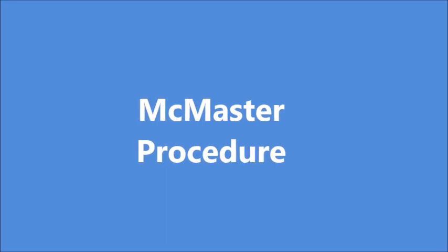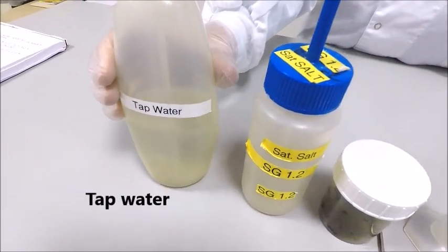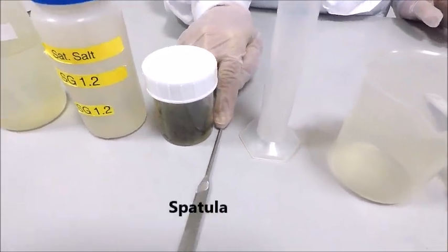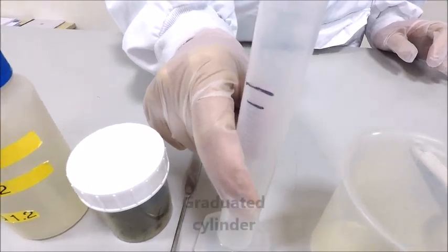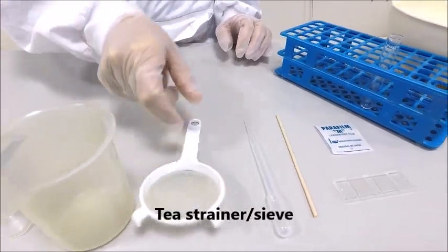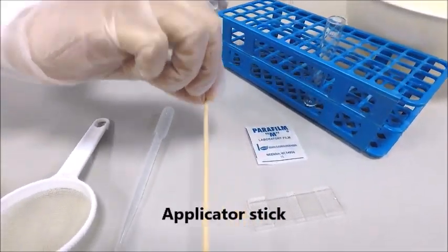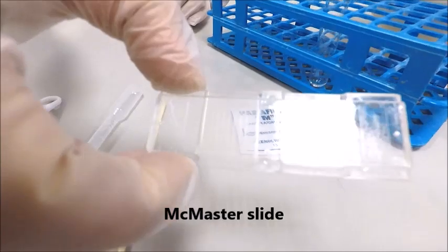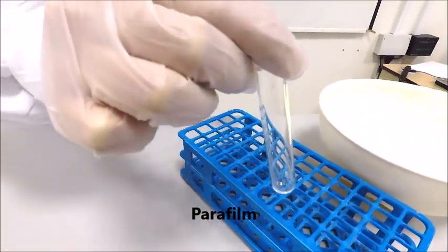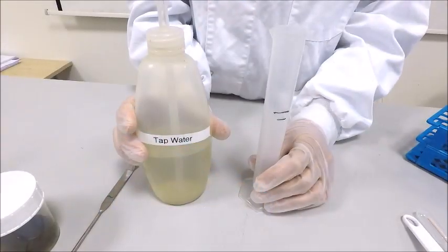The equipment required for the McMaster procedure: tap water, saturated salt, which is your flotation medium, your fecal sample to be analysed, a spatula and graduated cylinder, a beaker, a tea strainer or sieve, a disposable pasteur pipette, a wooden applicator stick, your McMaster counting chamber, a small square of parafilm, a 15mm test tube, and a waste container.